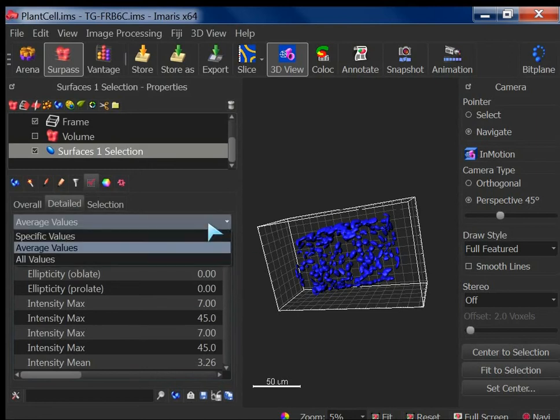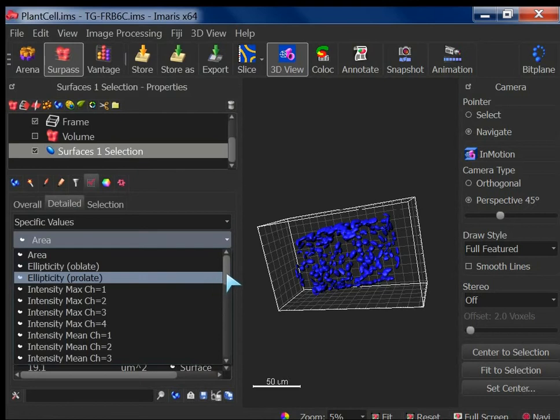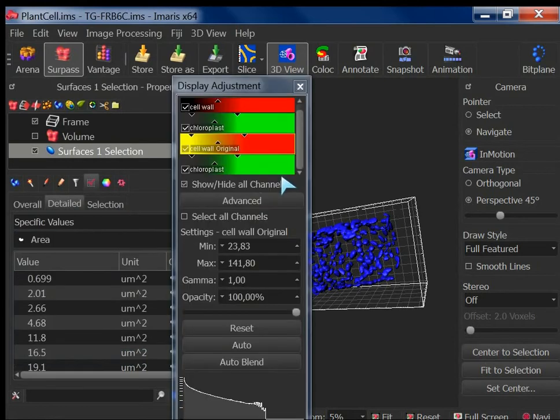This variable, which value, specific value. Yeah, here. So here I can say, okay, but here there's a problem that the name wouldn't appear here. You have to remember the sequence. So now I can see the channel number. I think it's the third one, right? Because then if you have confusion, you can Control D and say this.